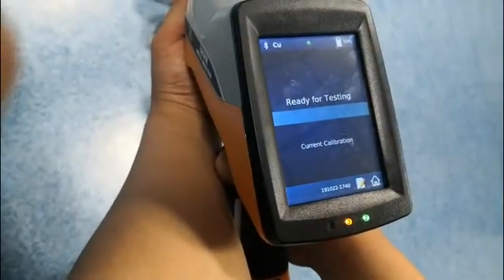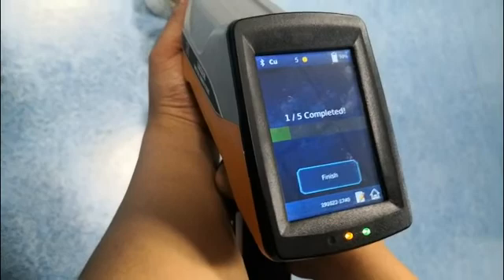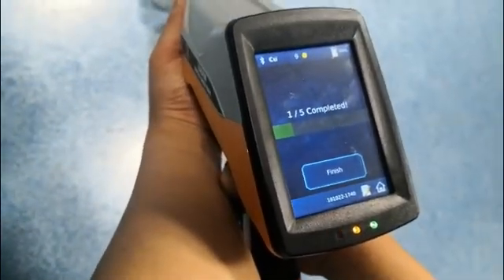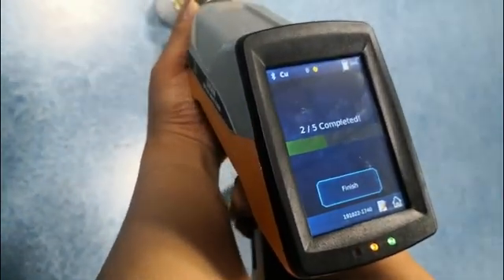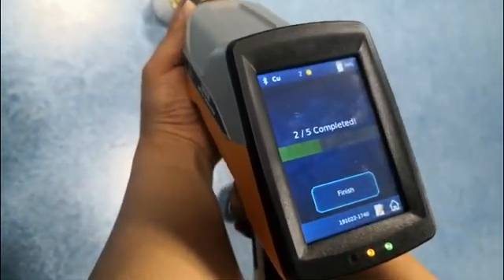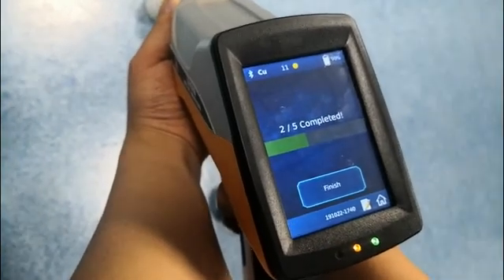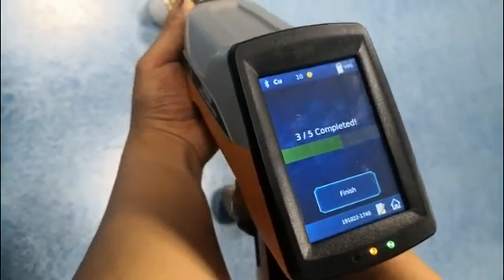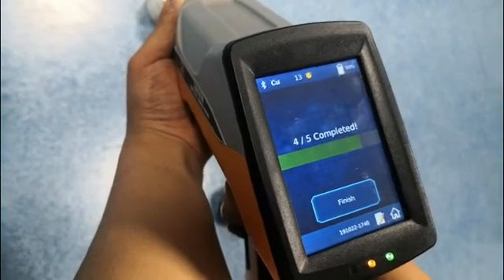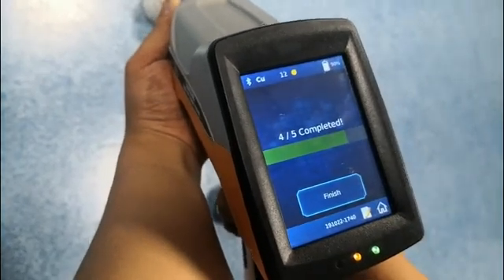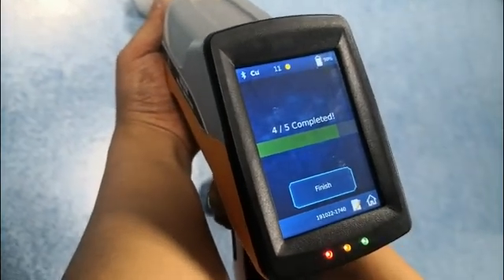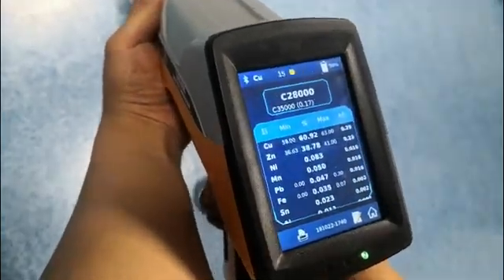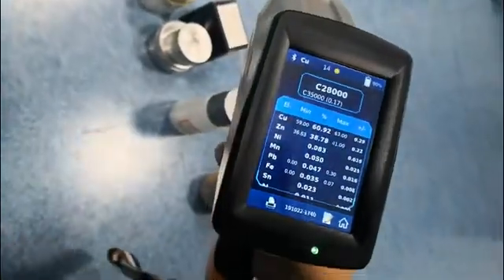One time, two time, three time, four time, five times. Okay, the result is out.